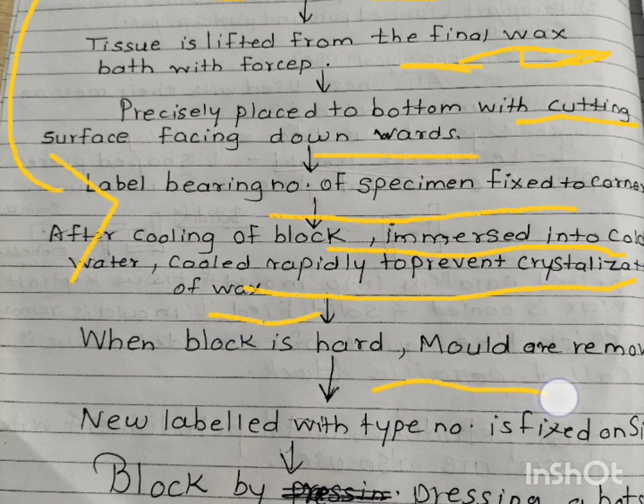When the block is hard, the mold is removed. So all of you know that after solidification the mold is removed. Then a new label has to be placed, by pressing the label with a hot force. The new block is ready for either cutting or storing. So this is the method of embedding. Have you understood about this?